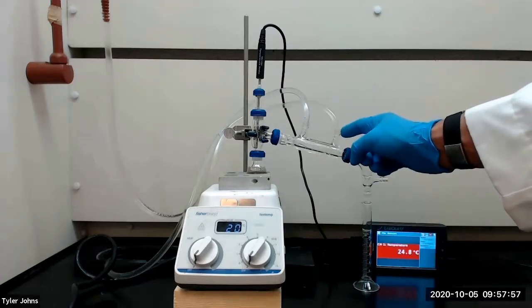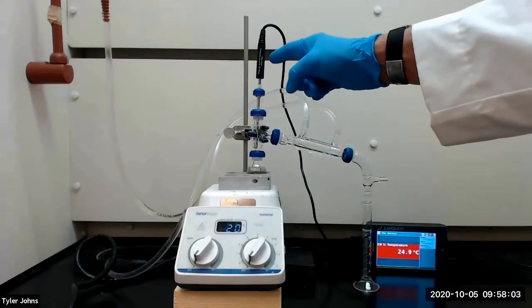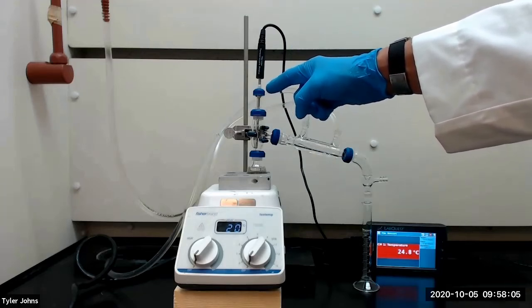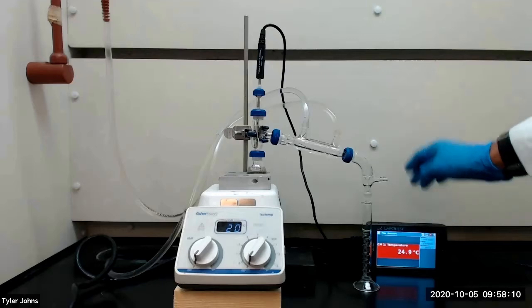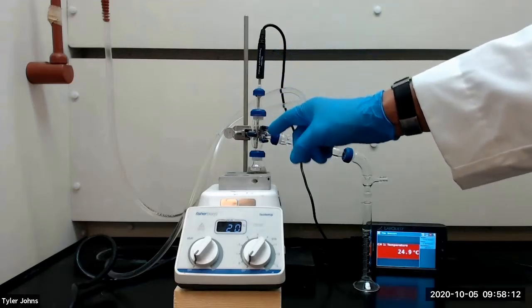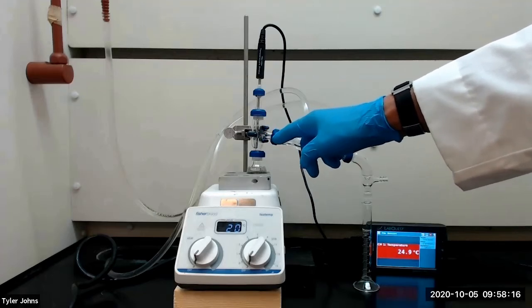The water enters our water-cooled condenser here and exits our water-cooled condenser here. And you will notice that we've inserted a vernier temperature probe into our simple distillation apparatus, and we will monitor the temperature of our distillation with the vernier temperature probe. Note that the probe extends below the side arm of the connecting adapter.